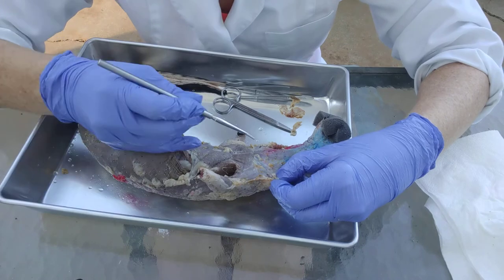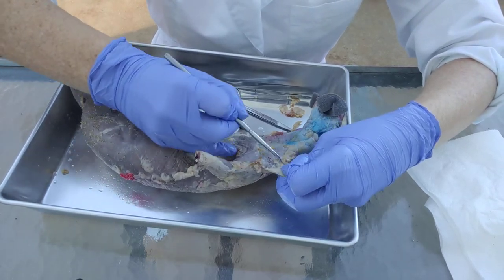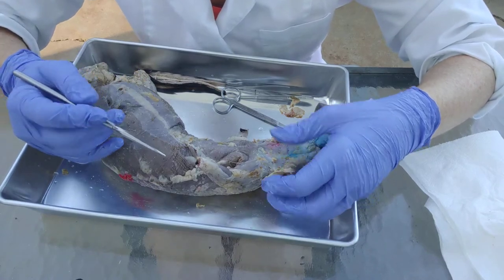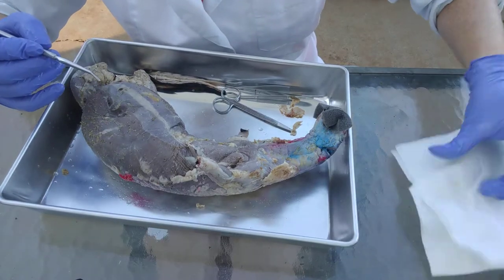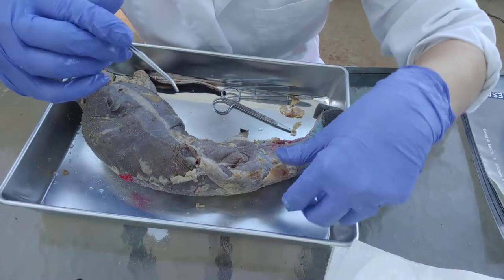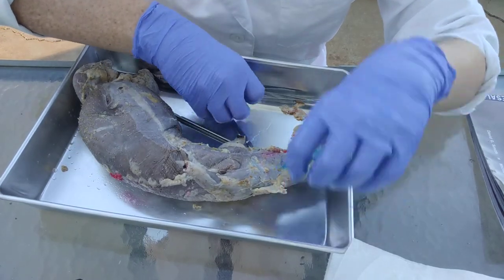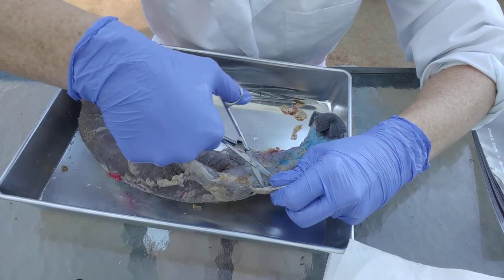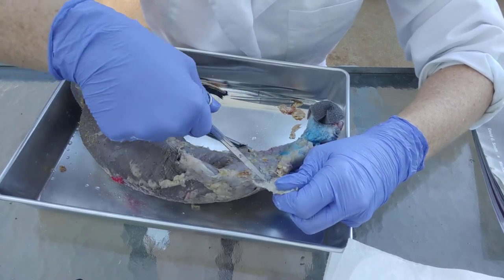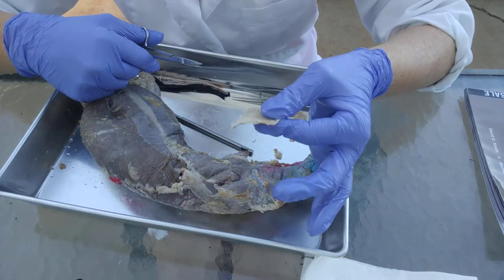Another technique is to use your blunt probe — you can pull up on the fat and just start breaking the connective tissue fibers as you peel it back. I think of this sort of like sculpting: you have an image in your head of what it's going to look like, which is why you especially want to make sure you have your dissection manual. If you know what it looks like, you just keep sculpting until it matches. Remember you're peeling off the fat — spread it apart until it's pretty much nothing, and once you're sure there's no muscle in it, take off that fat.